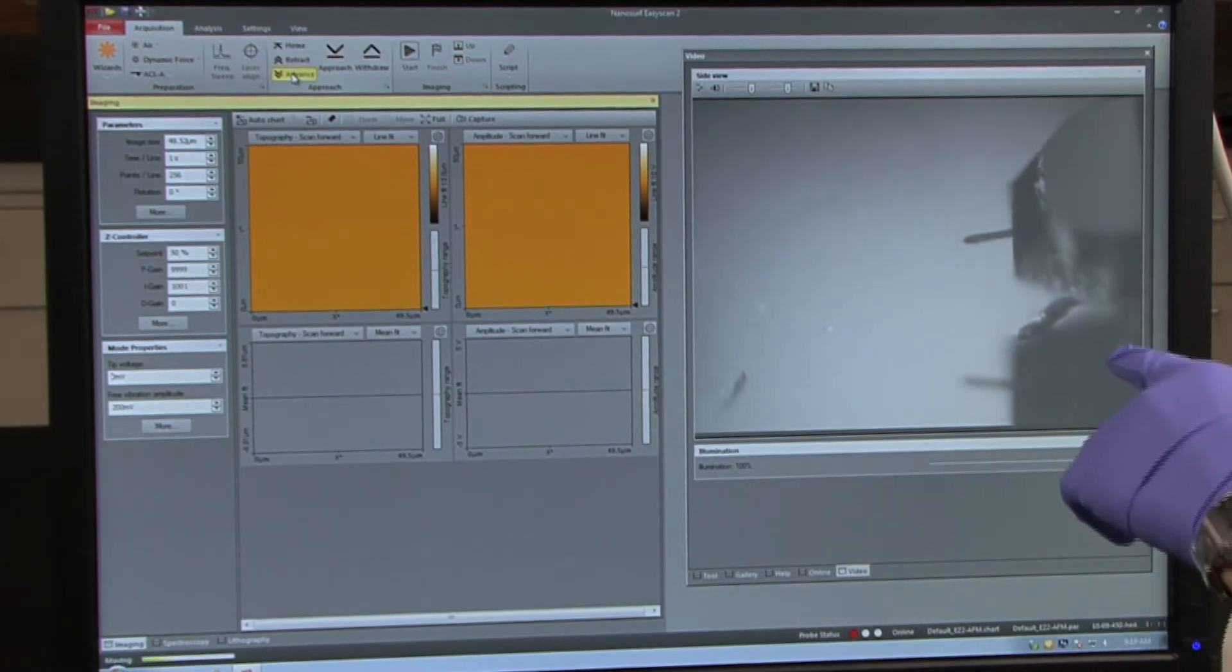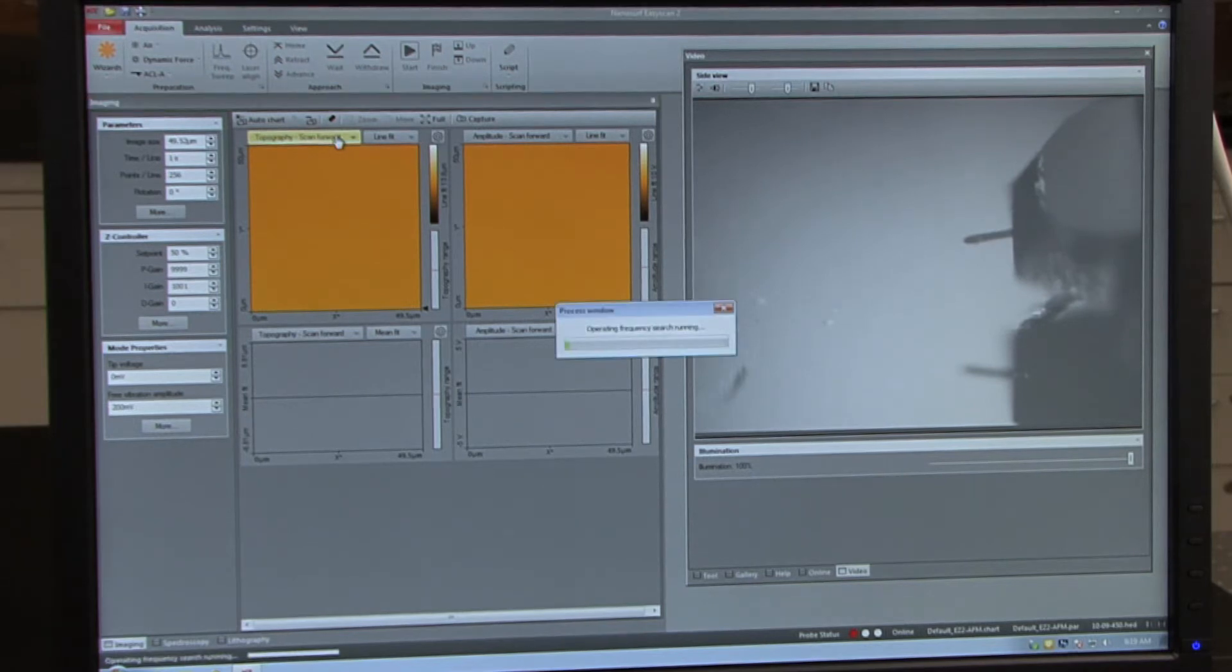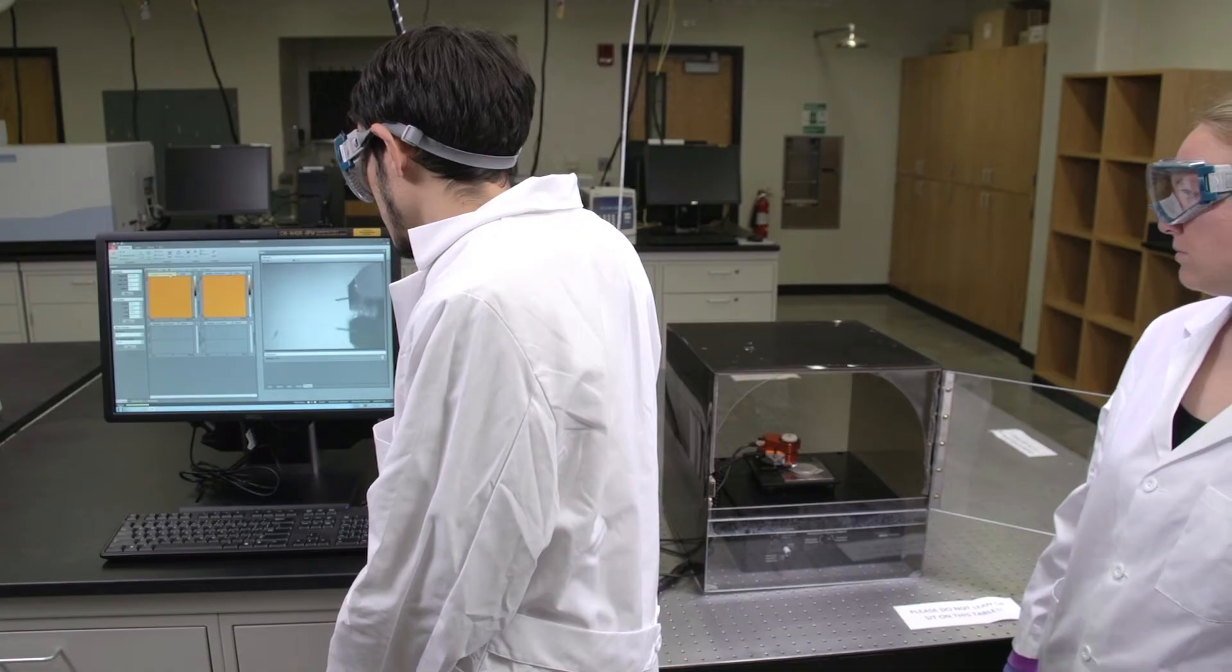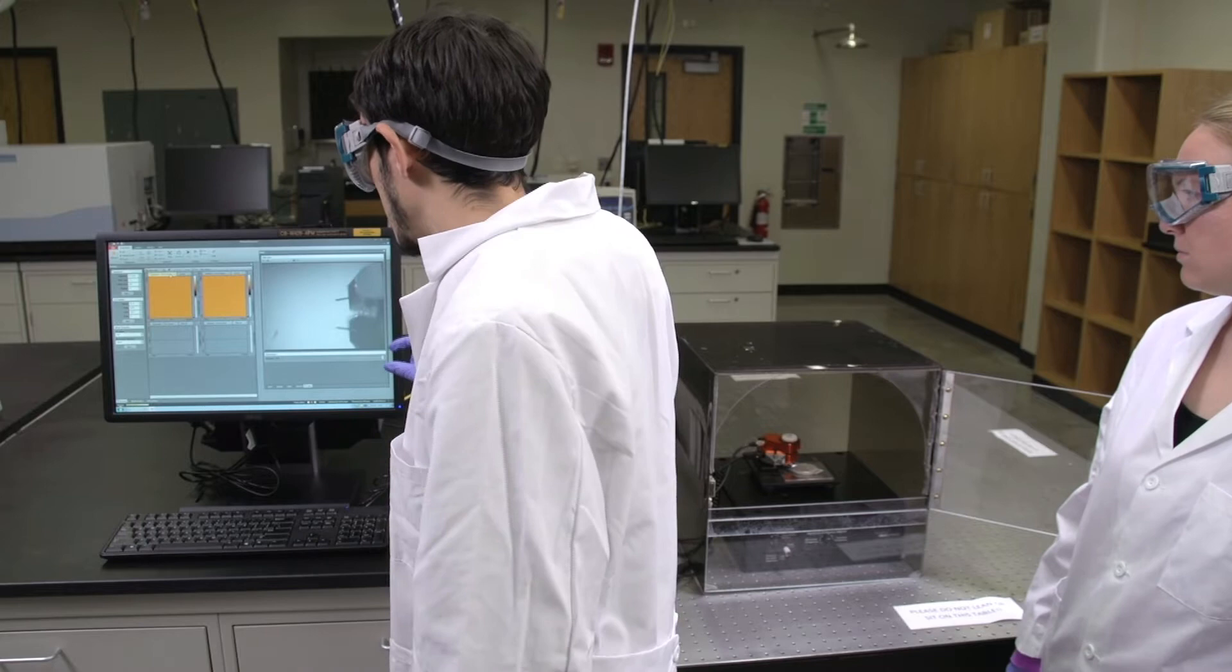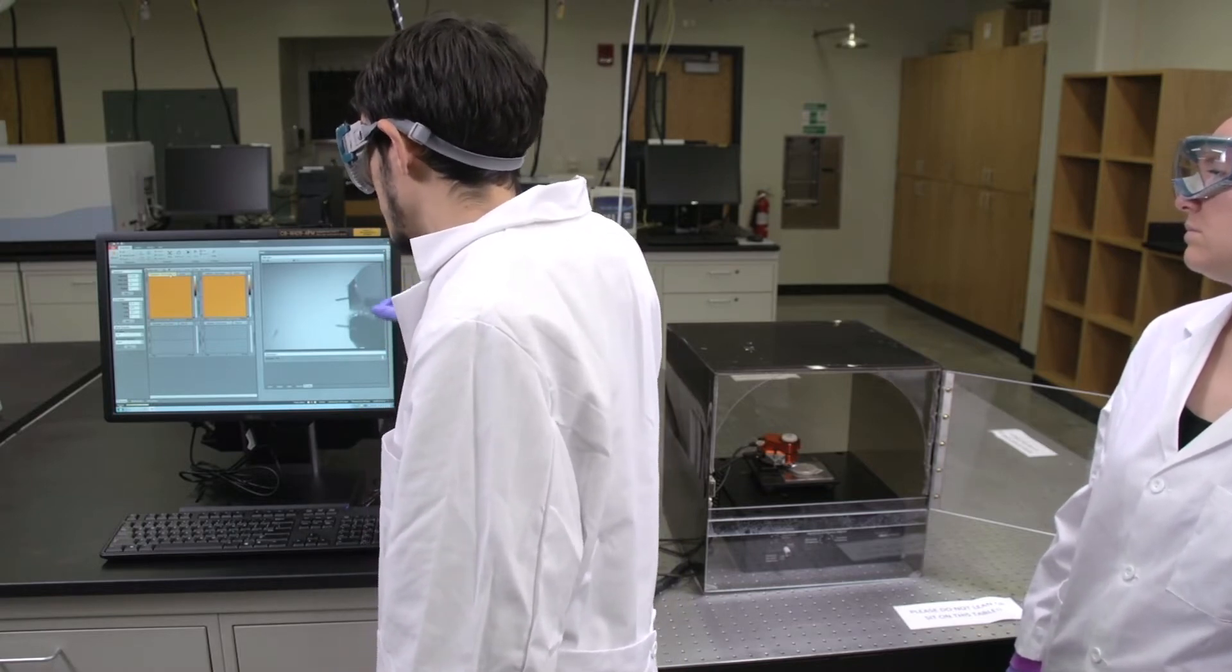Once the shadows are roughly touching, click approach instead of advance. You'll only need to click this once. You'll notice that an automated procedure has started, which brings the tip as close as possible to the surface.